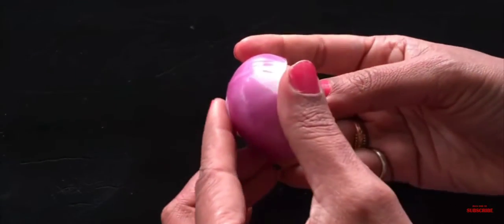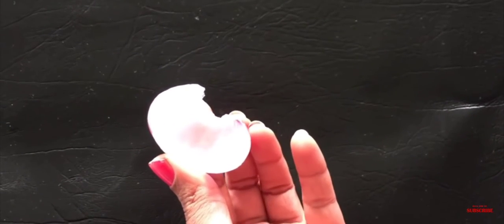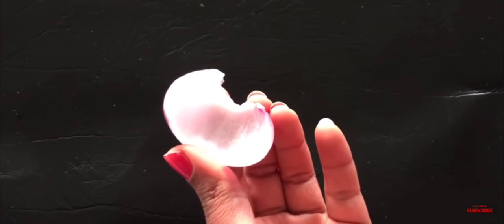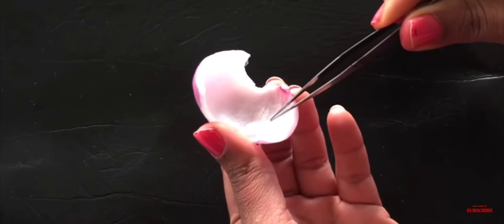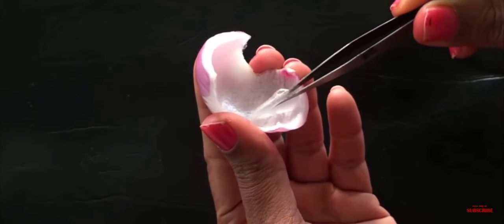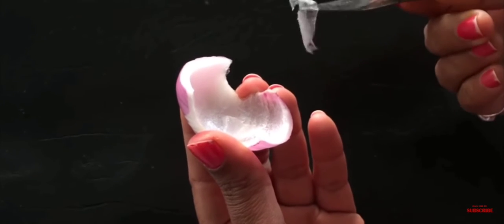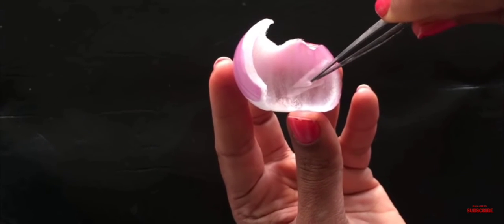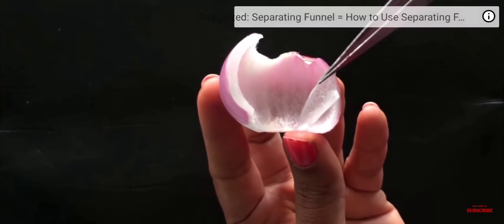So first an onion is taken, and in this way you have to take one of the covers of the onion, and then if you want you can fold it, or in some onions, very easily, an almost transparent layer can be taken out. This is the main part for which we are performing this activity. By using this transparent layer we can see the cells of the onion.